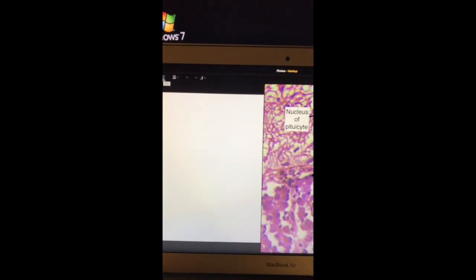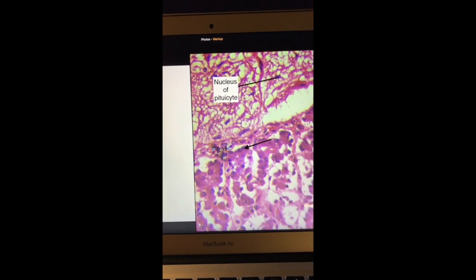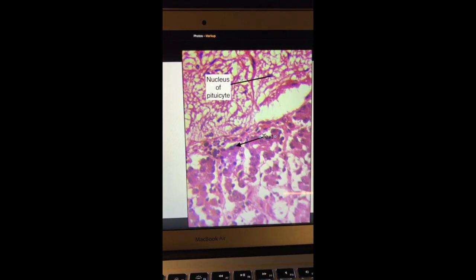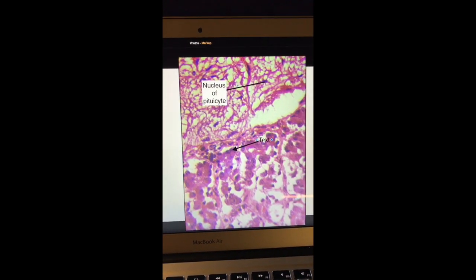and click this little icon, which is for the text box. And when I push that button, you'll see a text box appear on the screen. All you need to do is drag this right up here, and we are going to label the basophil cell, stained blue.